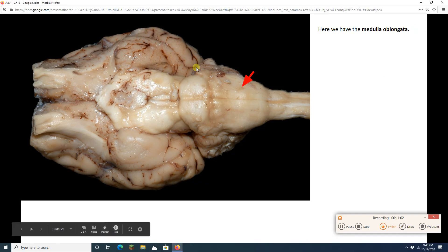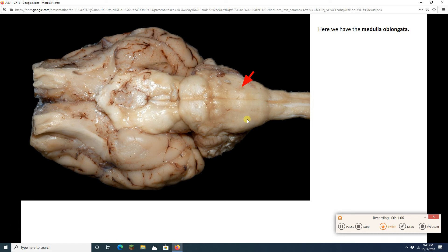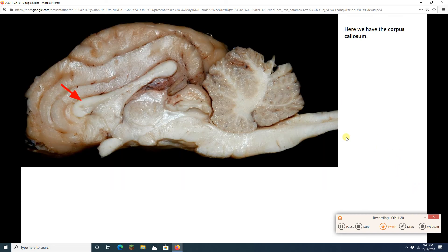Now we've got our medulla oblongata — beautiful medulla oblongata — going to connect higher and lower structures, and it's going to have a lot of nuclei for things like respiration, blood pressure, cardiac control, and more. And with that, we are done with the external view of the sheep brain.